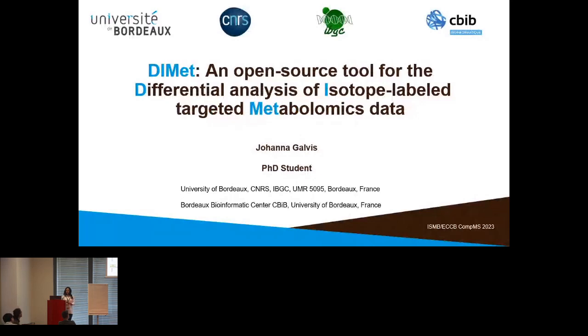So the functionalities of DIMet are globally divided into exploratory analysis by graphical representation of the data, and statistical analysis that is both univariate and multivariate. In the univariate group, we have the ability to compare between two conditions, to perform time course analysis automatically, and to perform multi-group analysis as well. For the multivariate, we have the principal component analysis, and finally the integration via the metabologram that I just explained.